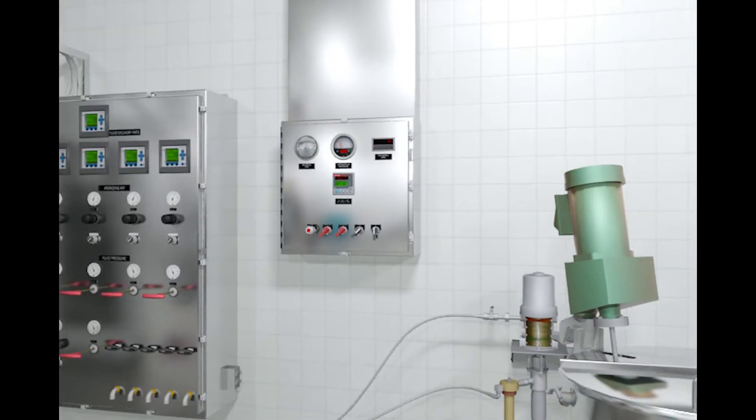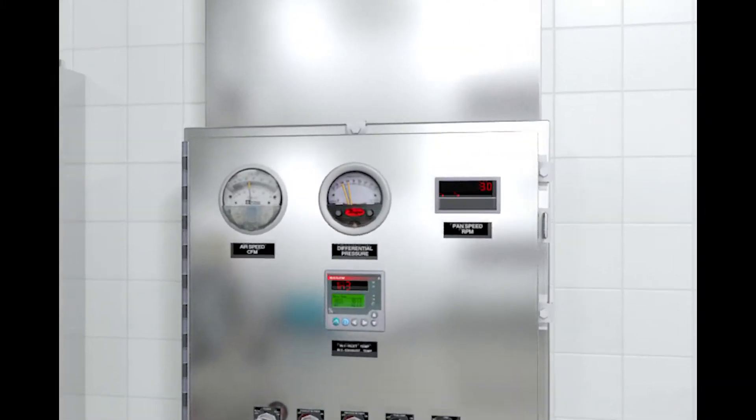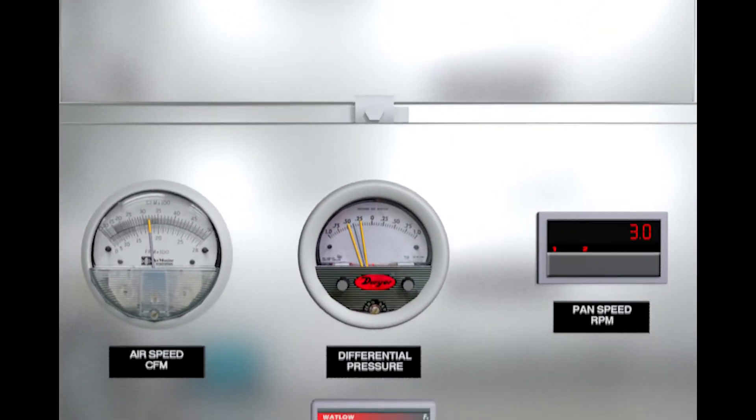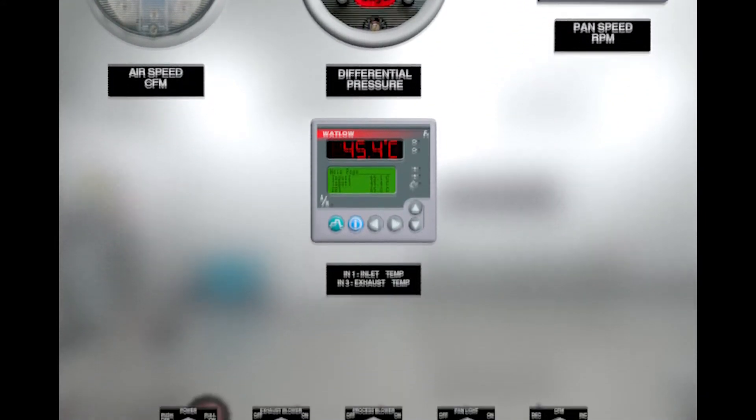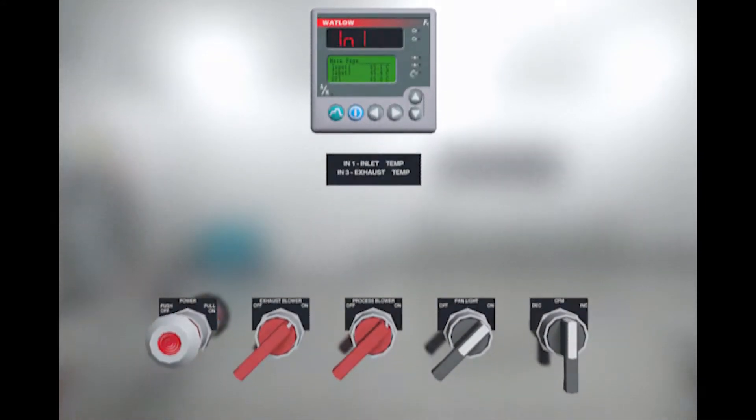The airflow is regulated for temperature and volume to control drying rates, while maintaining a slightly negative drum pressure relative to the room to isolate the operator from product dust and overspray.